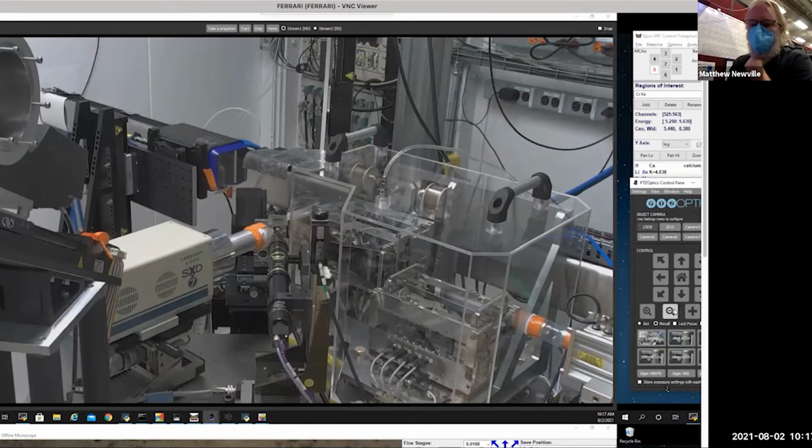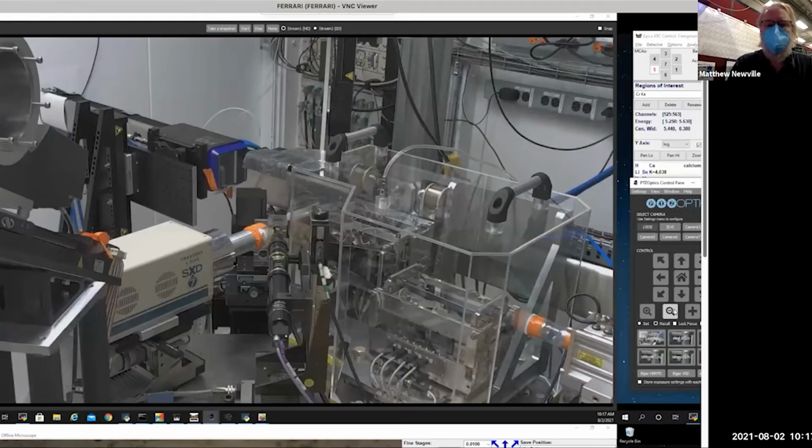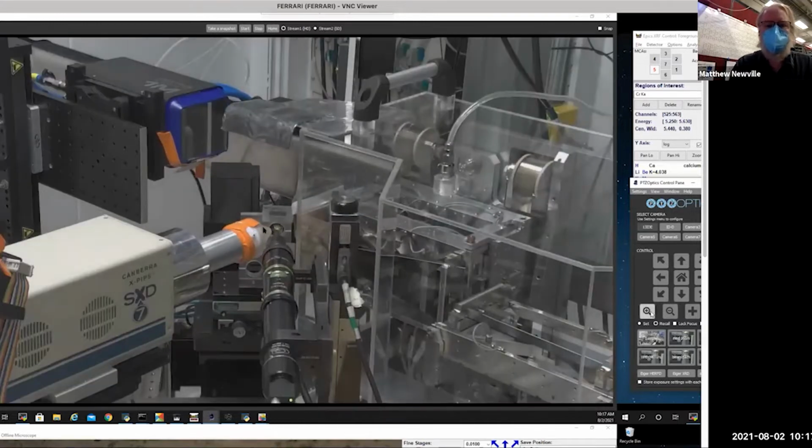And from there, like I showed, that is the beam on this sample, which is a cadmium tungstate phosphor. So this glows in the beam. This blue mark is the beam on our cadmium tungstate sample. We also have, normal to the beam at 90 degrees to the beam, and in the horizontal plane, a detector that's our fluorescence detector that will measure the emission off the sample. So we use that for all fluorescence measurements.